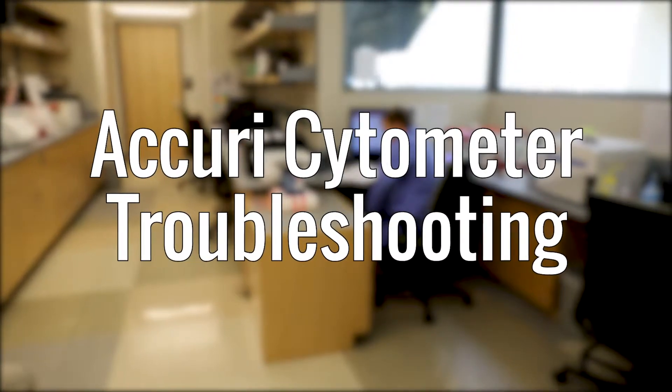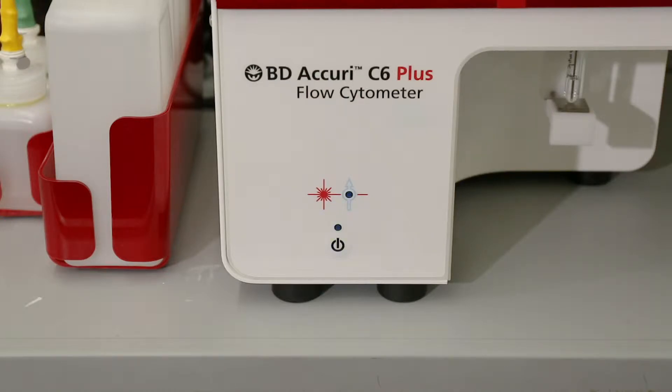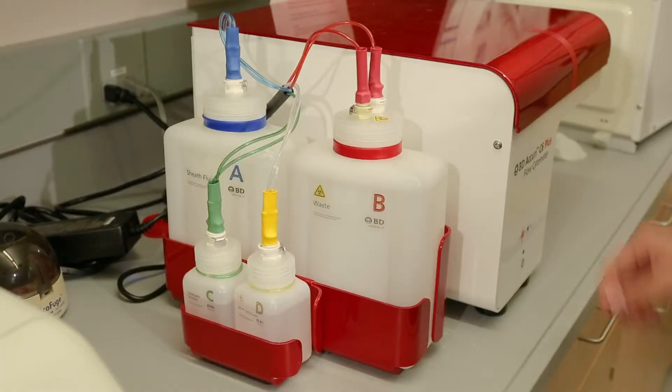If the Acuri takes more than 20 minutes to start up, check the front of the machine to observe the lights. If both lights are blinking together, it simply means that the sheath tank and waste tank need attention. Do the following.